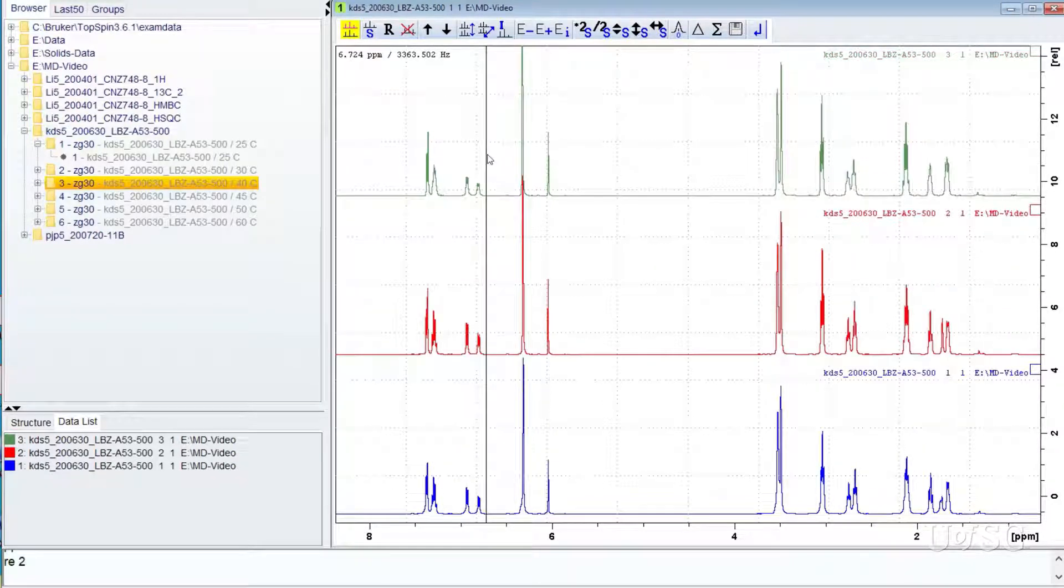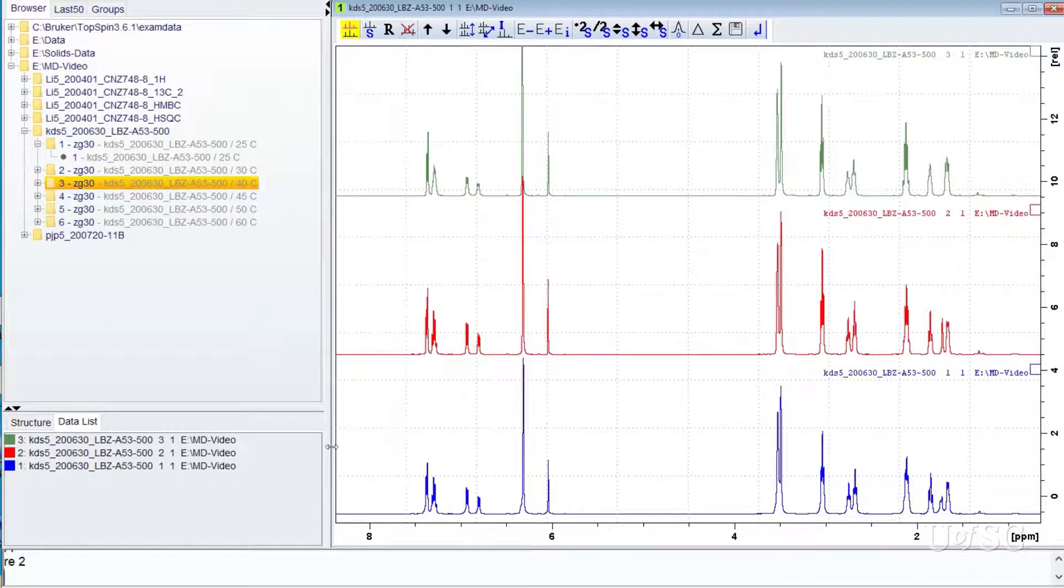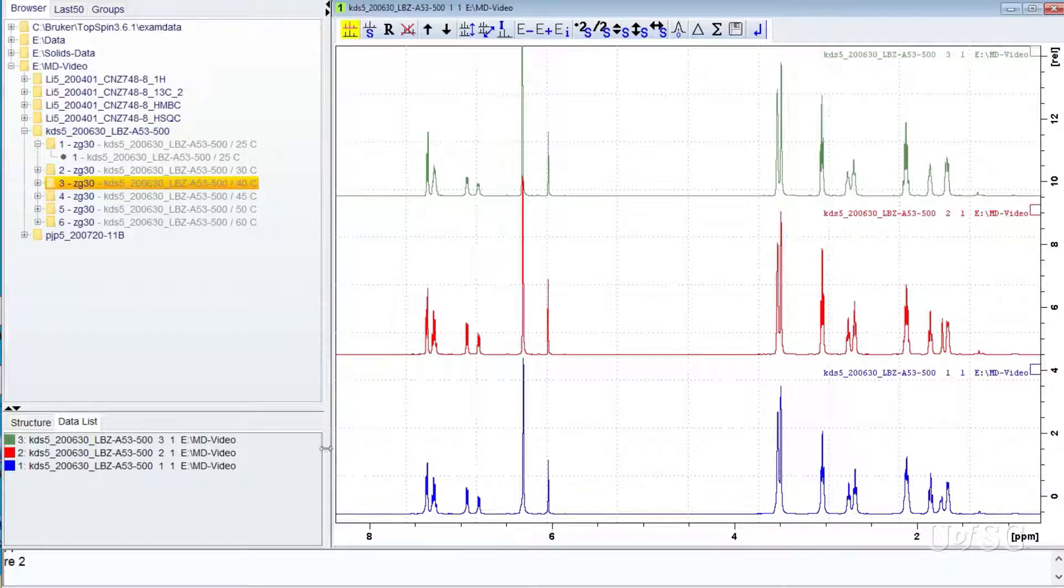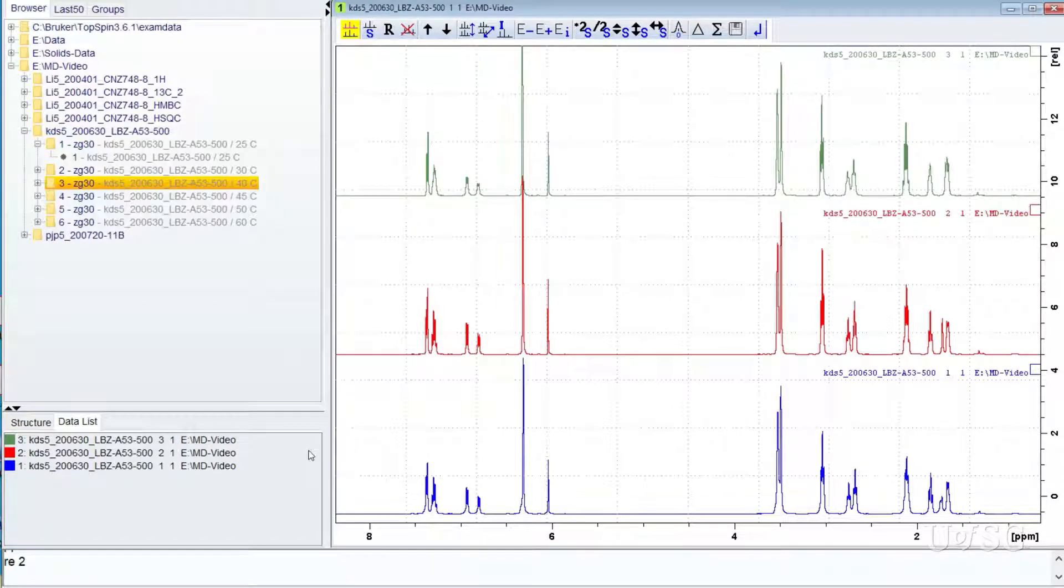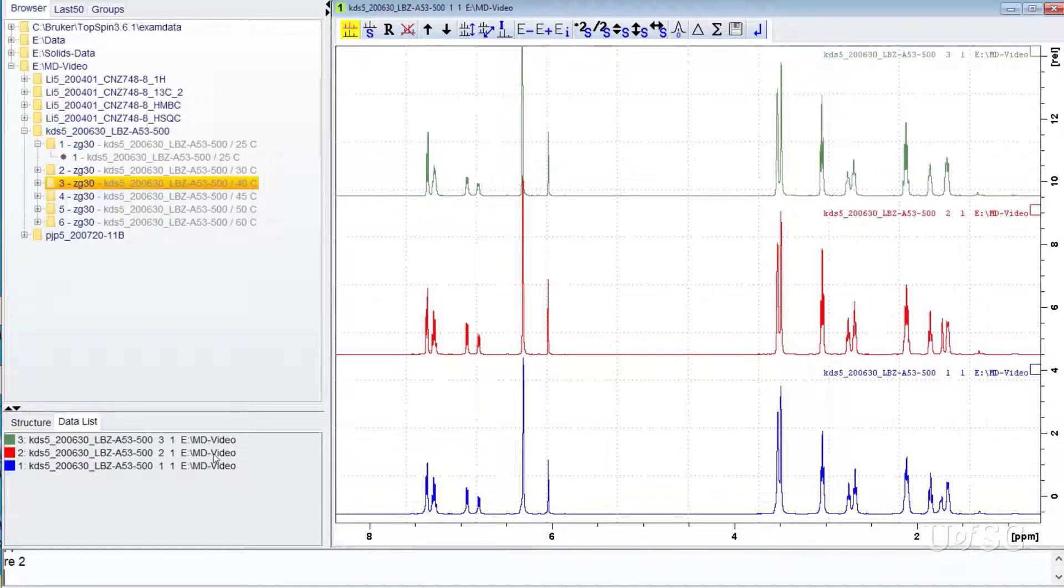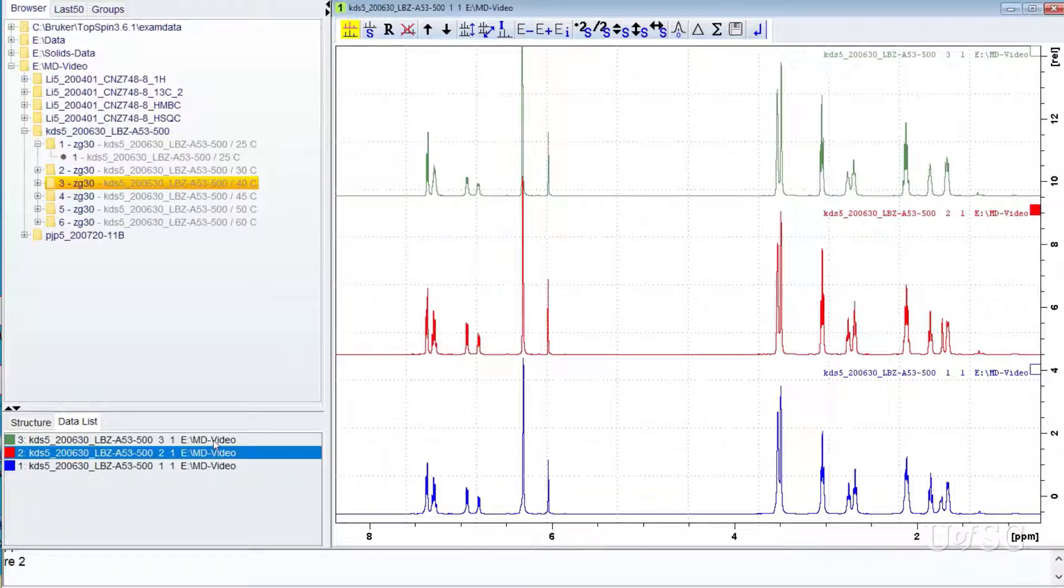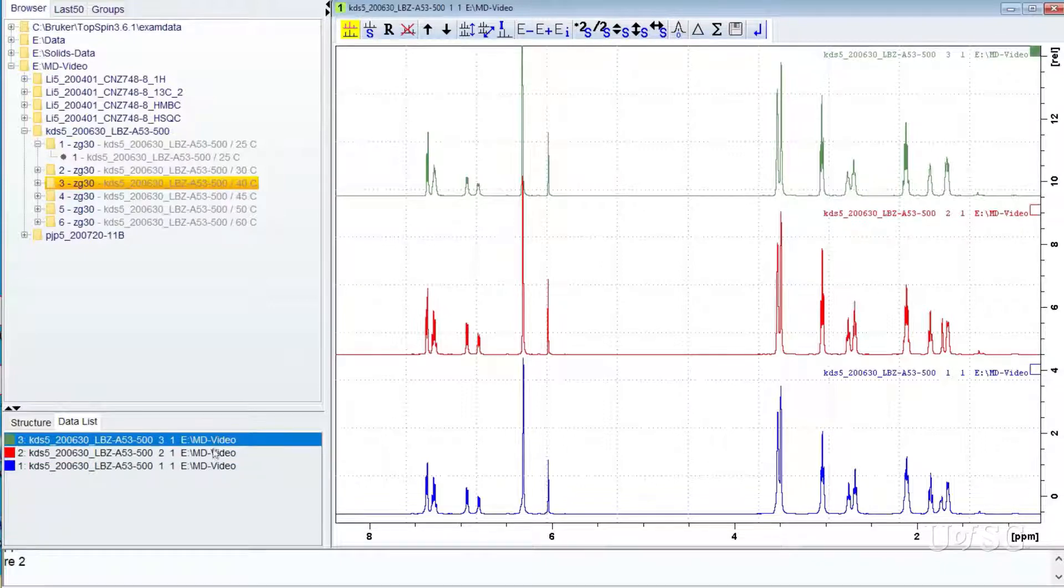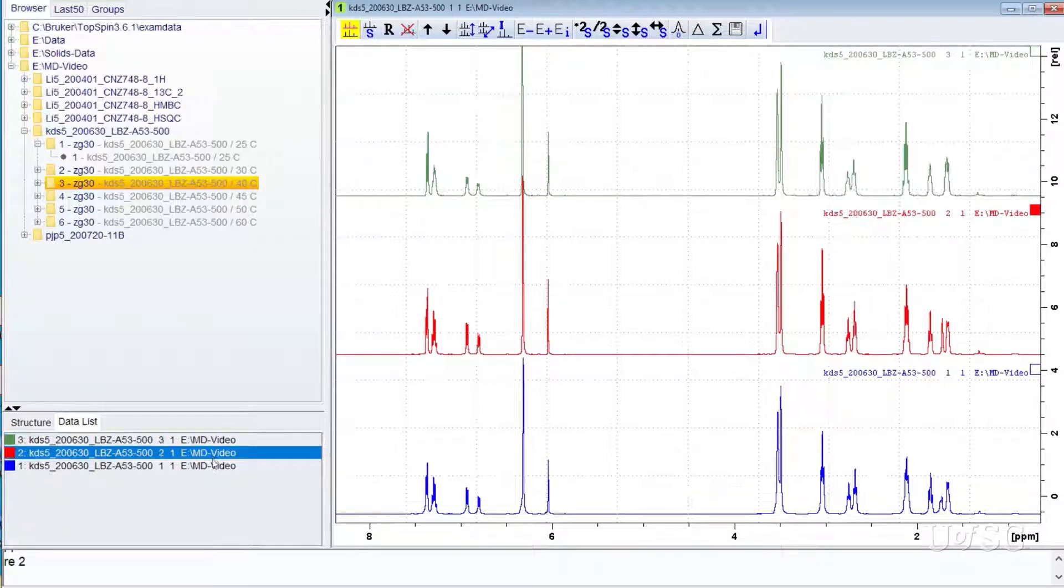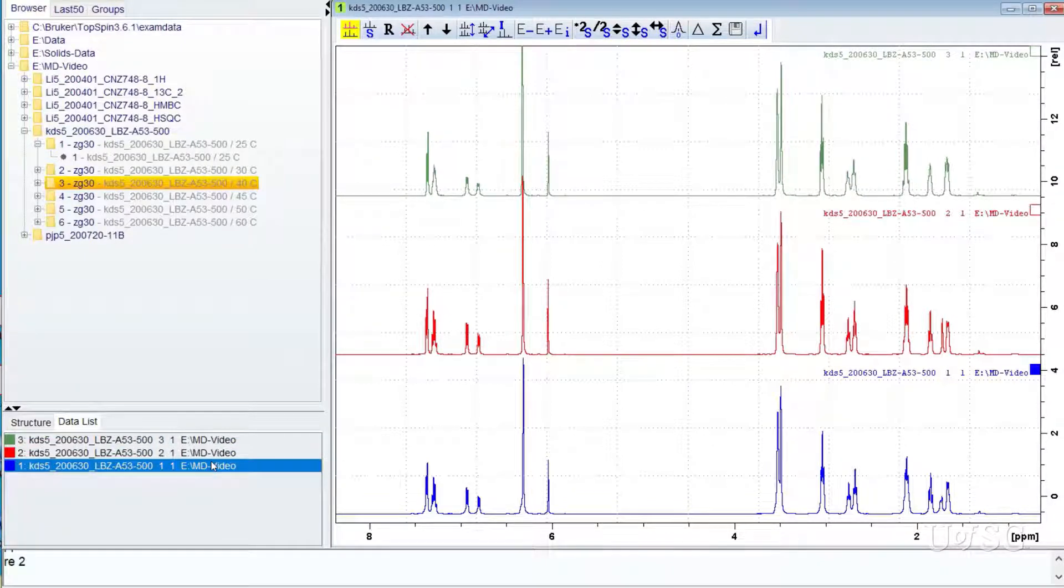The data list table will include the file names of individual files that are open. This table also allows you to select which spectrum is active for adjustments. Click on a line and the highlight will show that the trace is active.